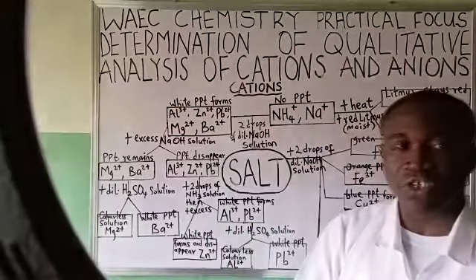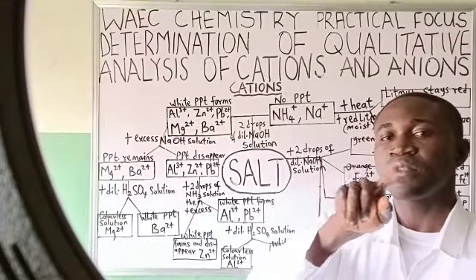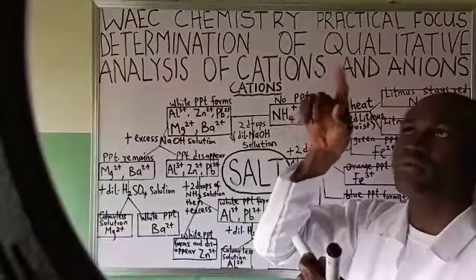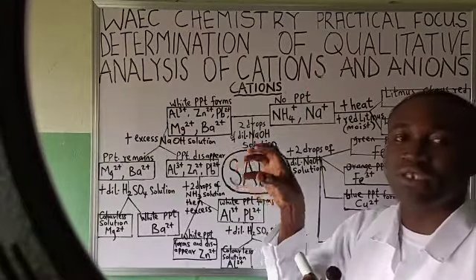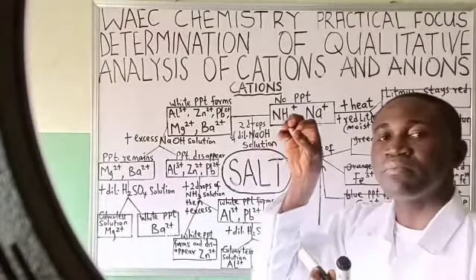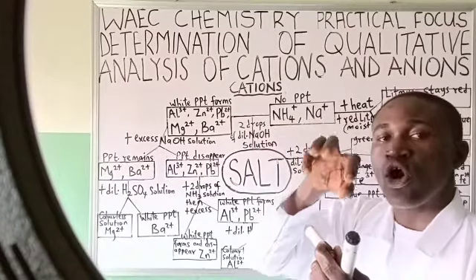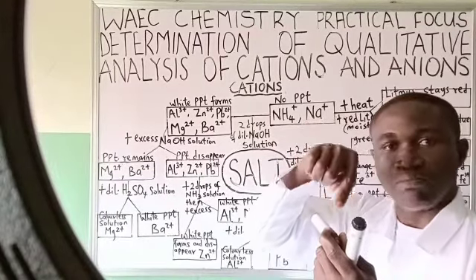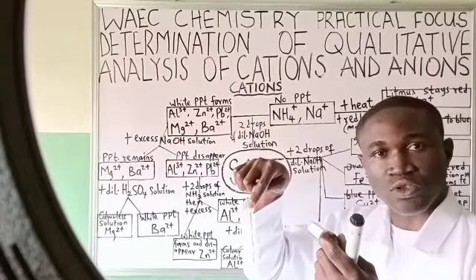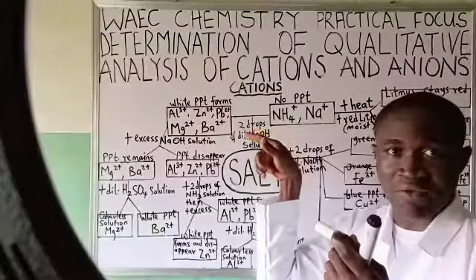Under your observation, under the color test, my observation there is that salt A contains a mixture of colored salt, and that would be my inference.